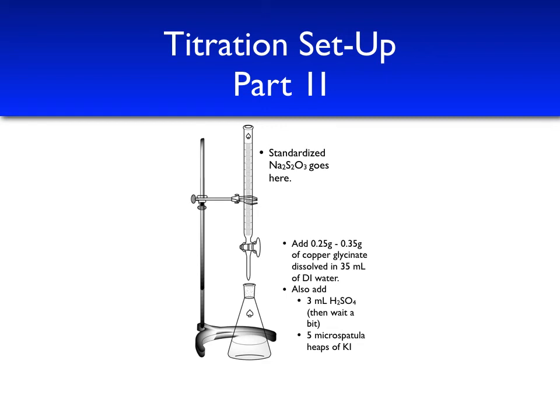This is what we're titrating. In our burette, we will put our now standardized sodium thiosulfate solution. Typically, we only do 2 trials for part 2, and a 3rd trial if necessary.